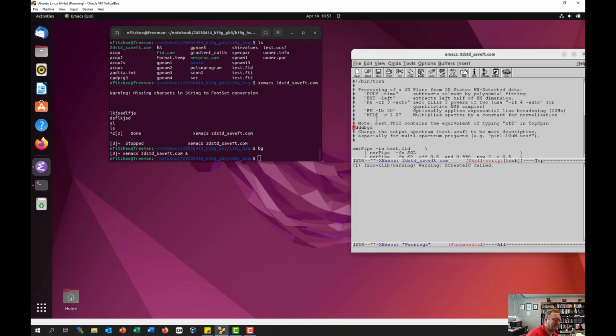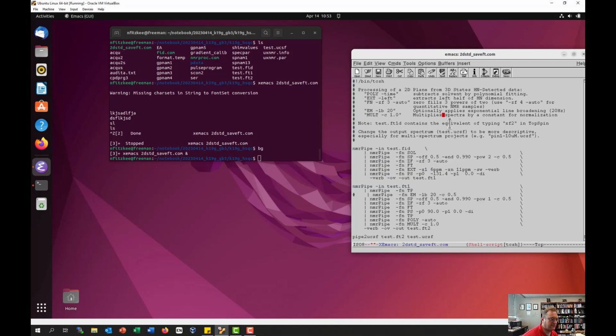So the faster you remember that, the better. Otherwise, you might have some fixing to do. But I think most of the lab computers are configured so that this doesn't happen. If you do get this weird bottom window, just click into the top window, Control X, and then 1.